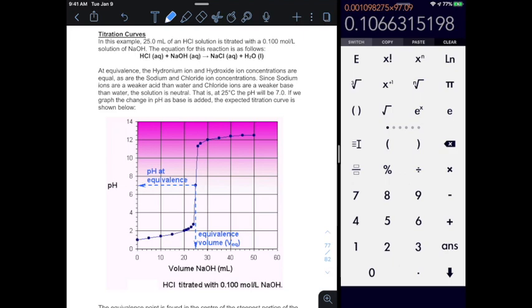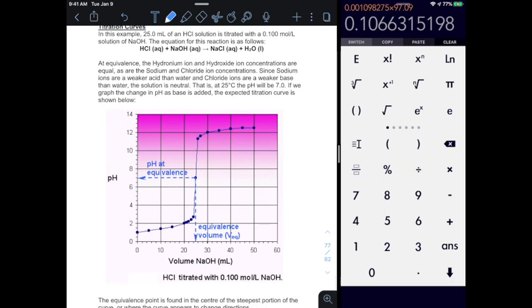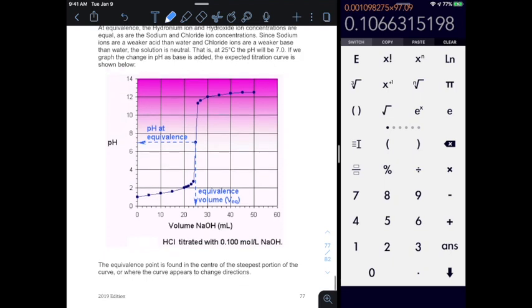And then suddenly, when you do this, it's almost magical. You'll drop one drop, it'll be clear, another drop, it'll be clear, and then another drop, it'll be pink, and then another drop, it'll be dark pink, and that'll be it. So drop by drop, this distance here is usually only a couple of microliters, or maybe a milliliter. So it's very, very difficult to manage that endpoint very carefully. It takes a lot of skill to be able to drop one drop at a time when you get right to the edge of this endpoint.